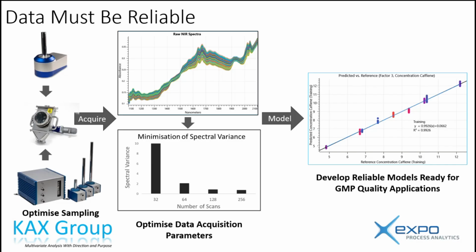Our goal is to take that TSE, the total sampling error, and the total analytical error, remove that sampling error, so that what we've got remaining here is the total analytical error. Okay? Now, we're never going to get perfection because nothing's perfect, but the more we can minimize that, the better we can rely on the models or the data that's being generated. It comes back to representative sampling.